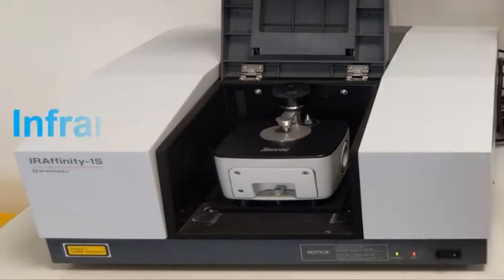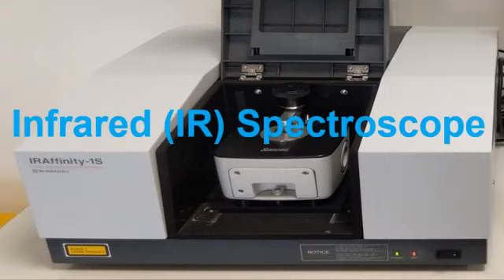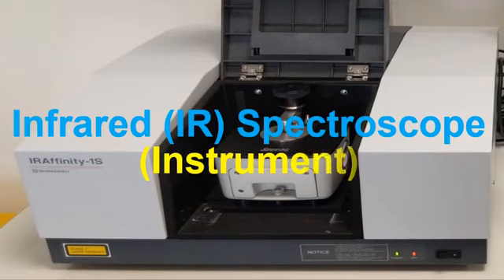In this video, I'm going to cover one of the basic instruments known as the infrared spectroscope, a basic instrument of inorganic and organic chemistry. The infrared spectroscope is used to identify a functional group or a bonding between inorganic or organic molecules and chemicals.